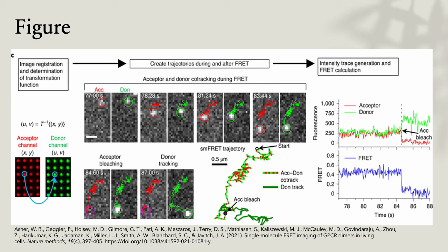Using SM-FRET, it shows that mGluR2 forms stable dimers at all receptor densities explored. Findings indicate that the dimerization propensity of some GPCRs may greatly depend on local concentration and thus differ across tissues and macrodomains.